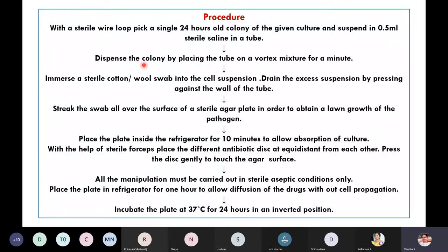After that, disperse the colony — since you have taken the colony from solid media, not liquid broth, you need to disperse it by placing the sterile saline tube on a vortex mixer for just a minute. The first step is now done.